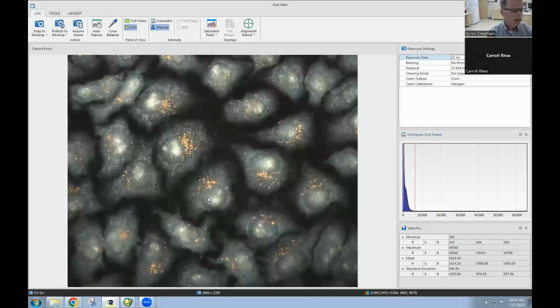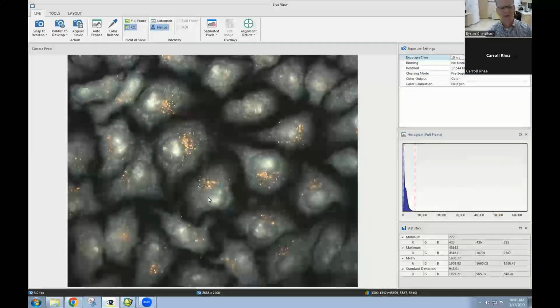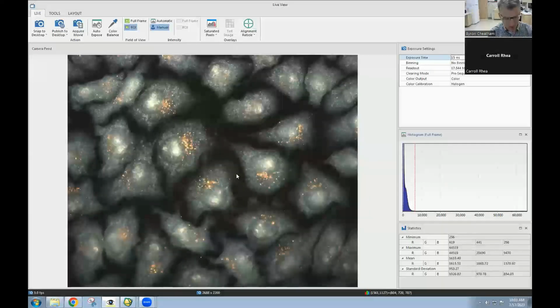On the CytoViva Enhanced Darkfield Hyperspectral Microscope, we have a live sample. If I bump the table that it's on, you can see it vibrate a little bit, showing that it's a live sample. You can see in this image that we have some almost confluent HeLa cells all throughout this image. These HeLa cells on an in vitro basis were exposed to 40 nanometer gold particles that had a peptide targeting protein on them so that they would be taken up by these HeLa cells. As we look around the sample here, you can see the cells, and these gold areas that you see here on the cells are actually the gold particles.